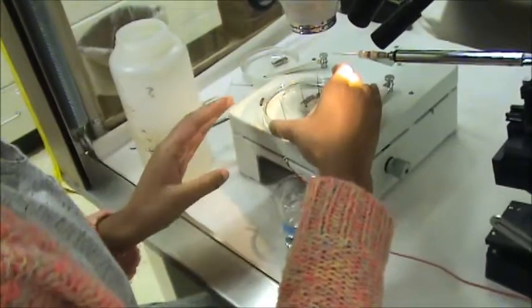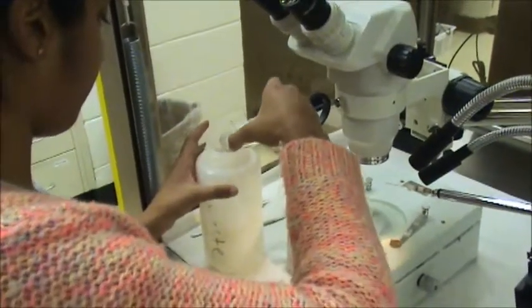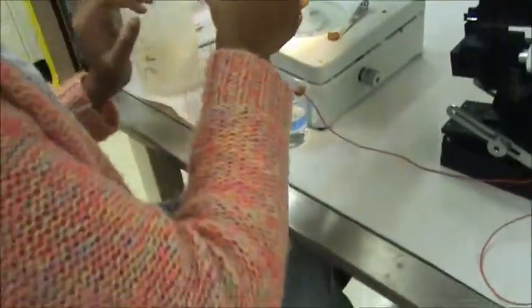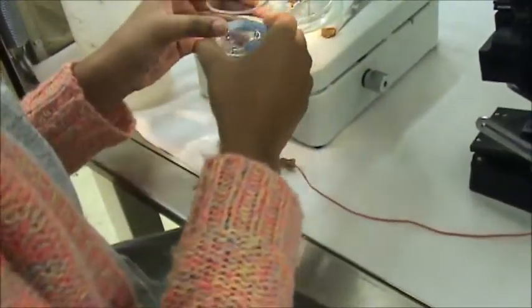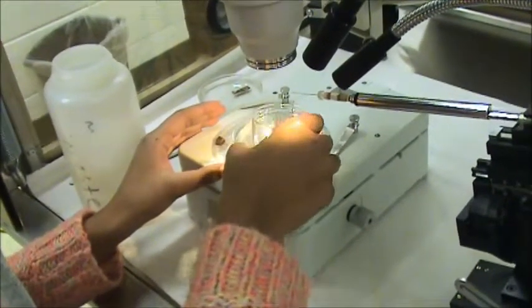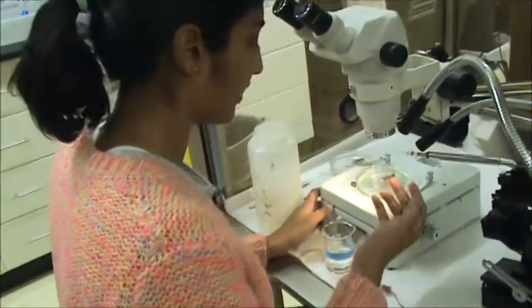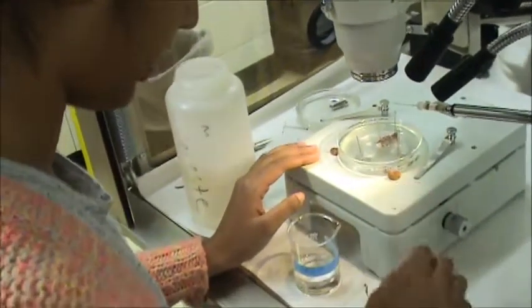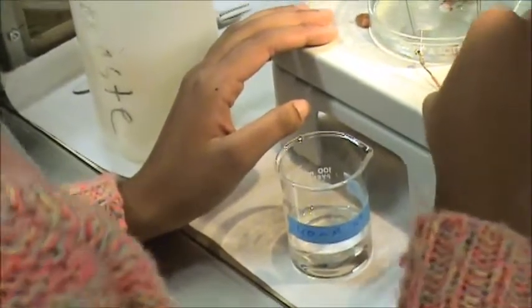And then we're going to want to dump this saline out. And you're going to want to put in either the potassium solution or the muscle juice. So you're going to want to be really careful not to hit the electrode with your hand or the dish or anything like that, because it could easily break. And don't forget to put the ground back in, because that's also important.